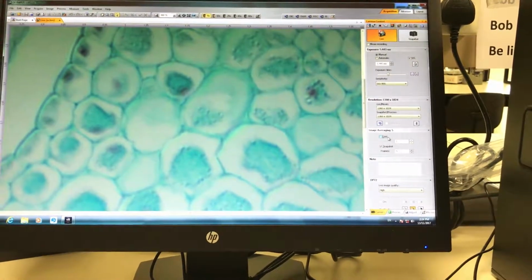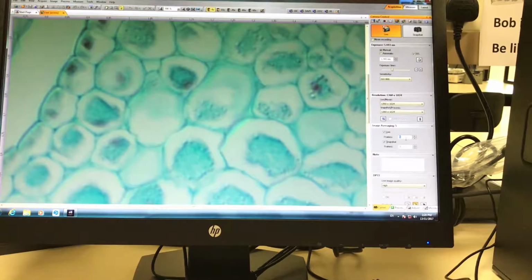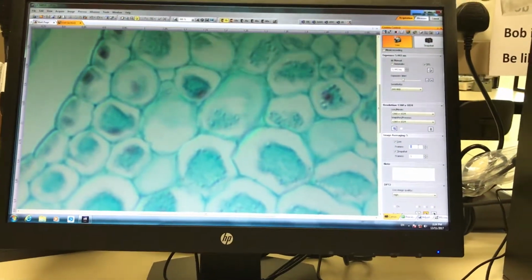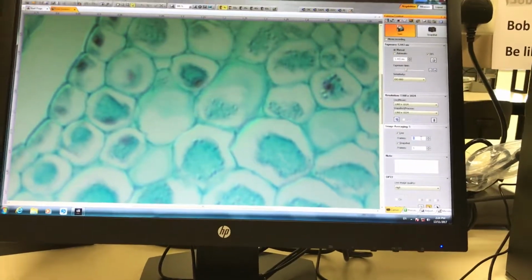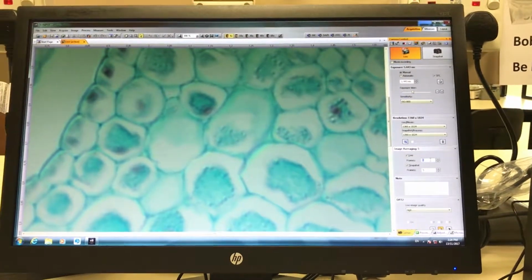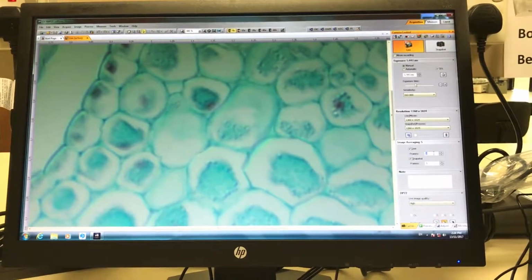So what is the max this can be set to? I don't know what the max is, but the higher the value you give, the longer you need to acquire the image. So again, it depends. Let's say your fluorescence sample is prone to bleaching, then when you use too high a value, before you acquire the image, maybe the signal has already bleached off. So you need to be careful.